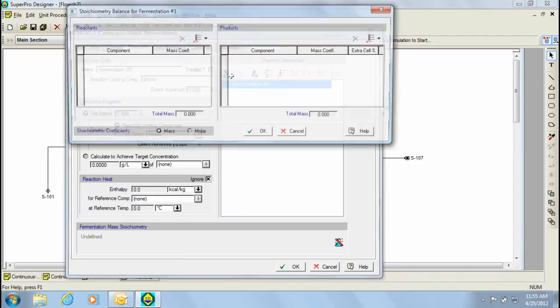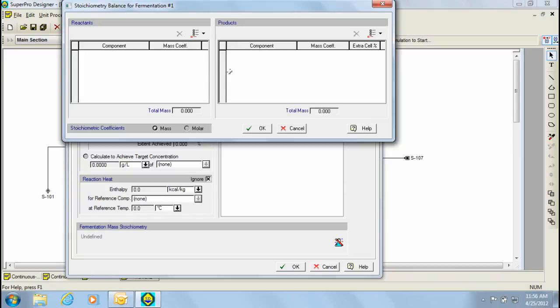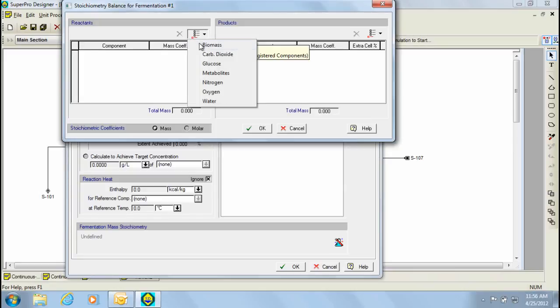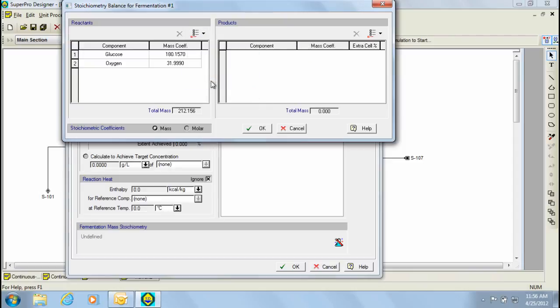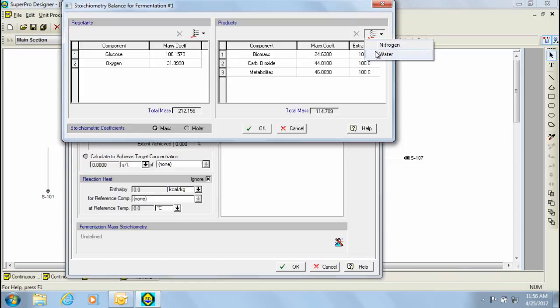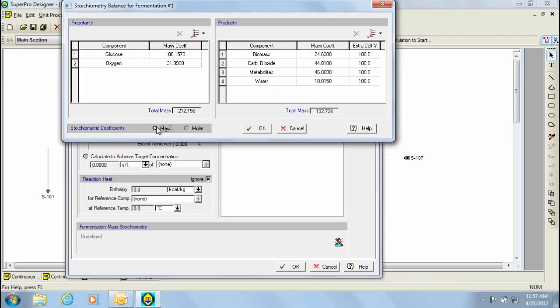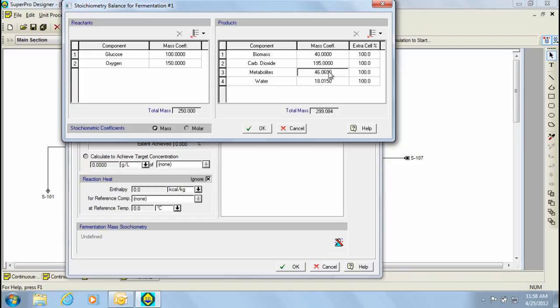Through this dialog that pops up, I can then specify my reaction. On the left hand side, I need to specify my reactants, glucose and oxygen, and on the right hand side, I need to specify my products: biomass, carbon dioxide, metabolites, and water. Furthermore, I have the option to specify the equation based on mass or molar stoichiometric coefficients. For this example, I'm going to specify it in mass, and the coefficients are going to be 100 for glucose, 150 for oxygen, 40 for biomass, 195 for carbon dioxide, 5 for metabolites, and 10 for water.